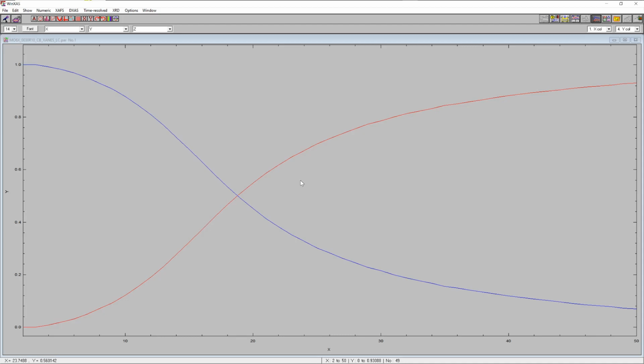And this, of course, can also be analyzed now. Since we do have a time-resolved experiment, we have some time axis here, basically. So this is an isothermal run, so we could easily convert the x-axis into reaction time. And so since we have a time axis, we can actually do some kinetic analysis if we wanted to. Since we do have those traces, might as well use them and do some kinetic analysis. And there are some ways to do this implemented in the software. I'm very briefly just going to introduce them.